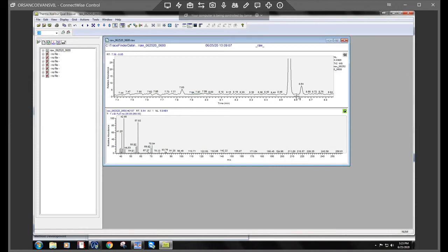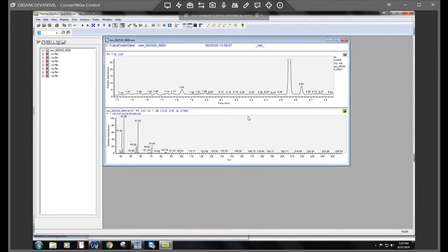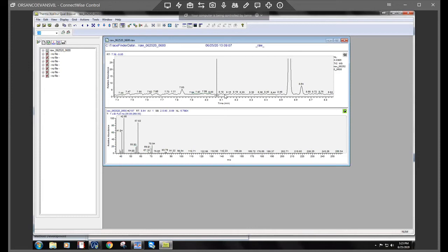And then what you would do is you would click on the baseline just to the left and just to the right of the peak in question. So I'm going to pick a certain point here and I'm going to click and then I'm going to come over here and I'm going to click.